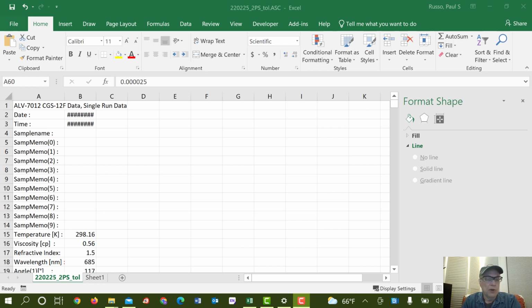The data are imperfect. They come from polystyrene and toluene solutions. It's just garden variety polystyrene that we bought from Sigma Aldrich or somebody. I think the molecular weight is about 170,000, although I can't remember if that's in weight or number average molecular weight, but it doesn't matter.